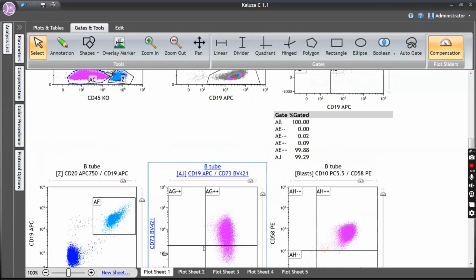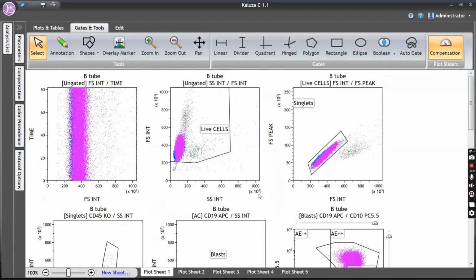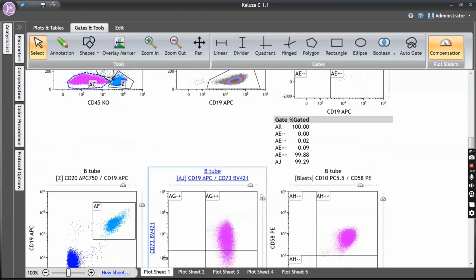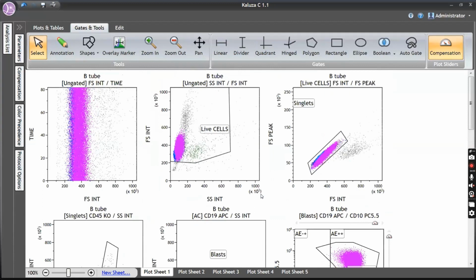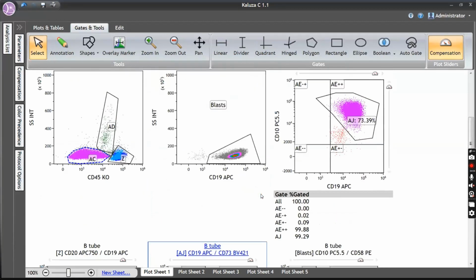Now my question to you: why can't this be hematogones? Hematogones can show CD19. Hematogones can show CD10. Hematogones can show CD34. Why can't this be hematogones, and why do you want to call this a B lymphoid blast? The way CD45 is, the side scatter is a little higher and the markers are all homogeneously expressed. I'll take that point, the last one that you said: markers are all homogeneously expressed.